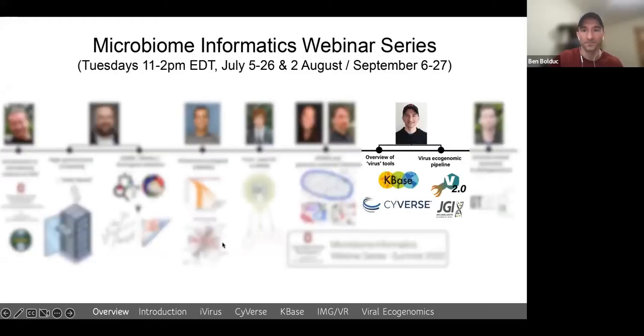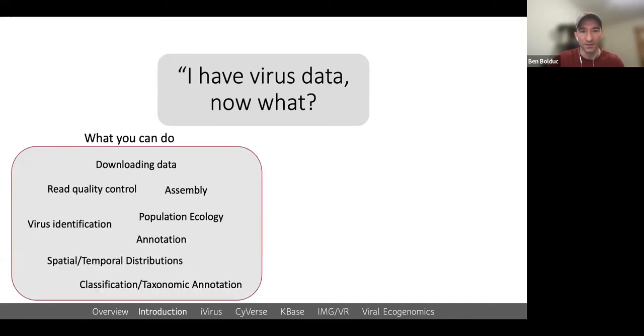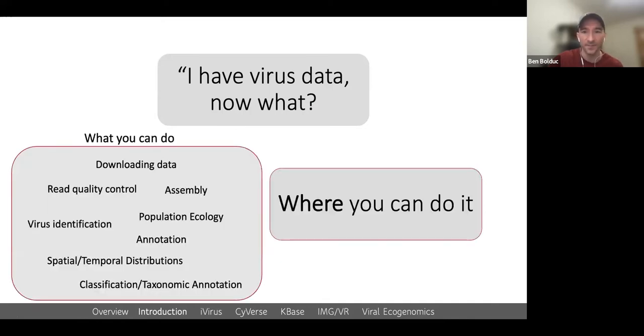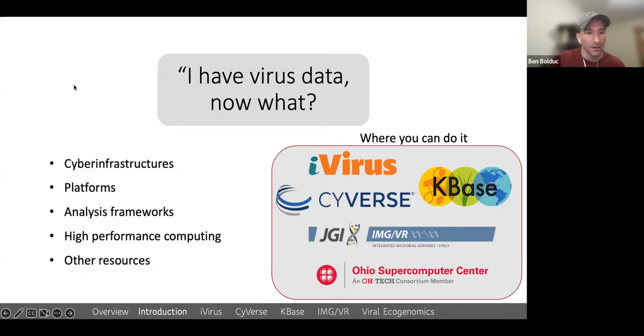Okay, so I have virus data: what you can do with it, and where. These are the areas where you can do some of this processing. I've gone over that these encompass cyber infrastructures, platforms, analysis frameworks, HPCs, and other resources.